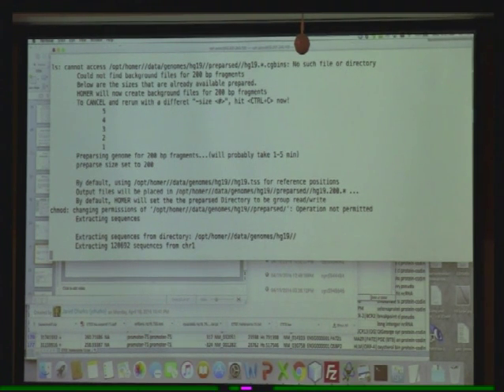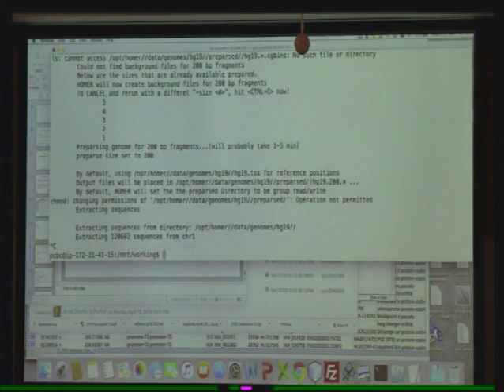You can also say, I want to look at motifs that are 8 base pairs, 9 base pairs, 10 base pairs. There are all these different options within Homer to find the motifs. I'm going to stop this, but when I upload the presentation, you will see all the command lines so you can do it at home.